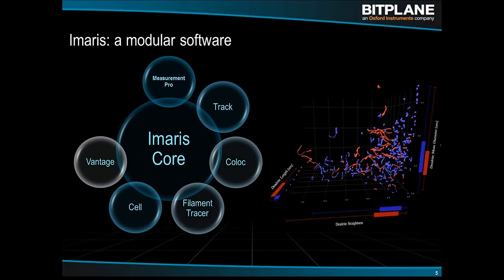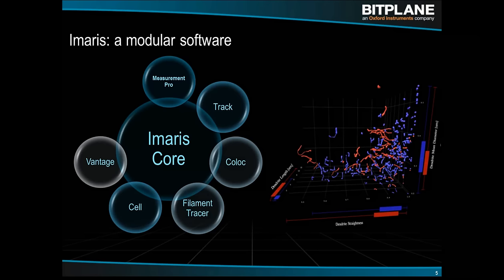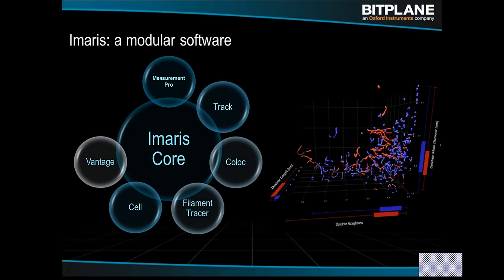And as you can see in this particular image, one option is to render the components of that object directly into the scatter plot. So here you're looking at different segments of the filament that was detected, and instead of rendering them in their original shape and spatial relationships, each segment has been rendered as a separate point in the plot with its actual shape. We're looking at the straightness versus the length versus the mean diameter, and showing what the actual object looked like that is represented by that point in the plot.